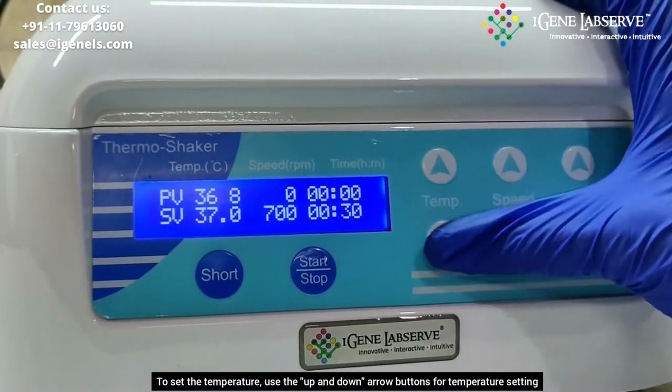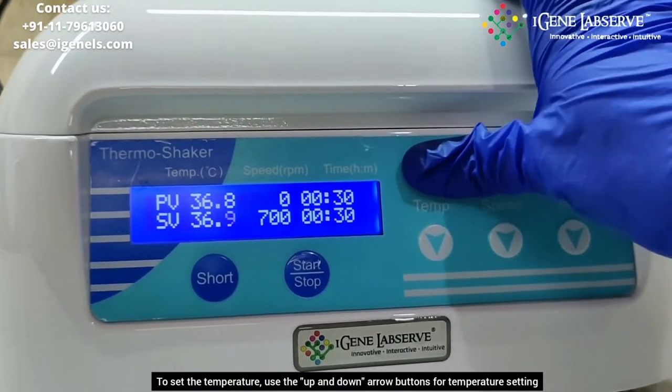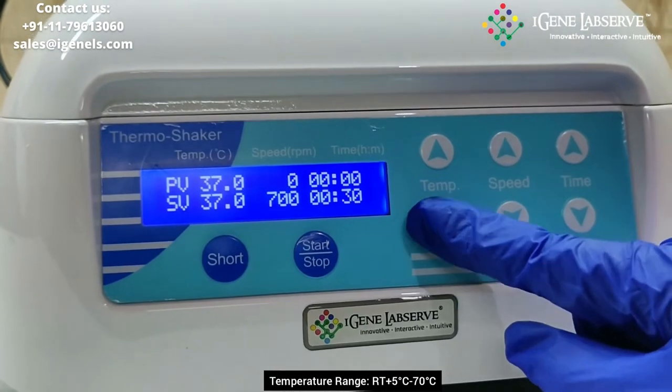To set the temperature, you have to use these 2 arrow keys — up and down — to increase or decrease the set temperature. The temperature ranges from RT plus 5 to 70 degrees.